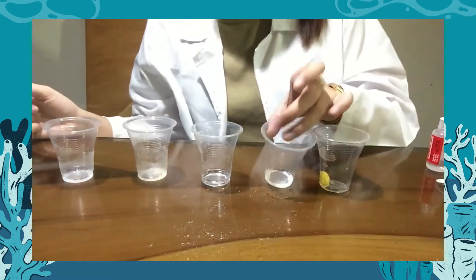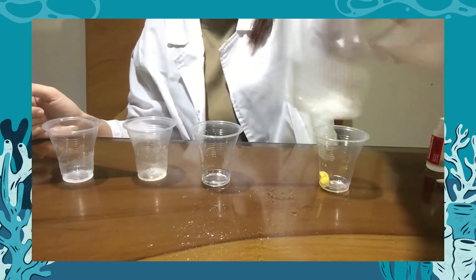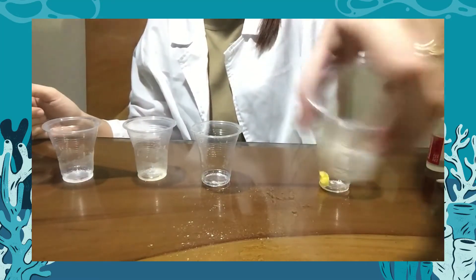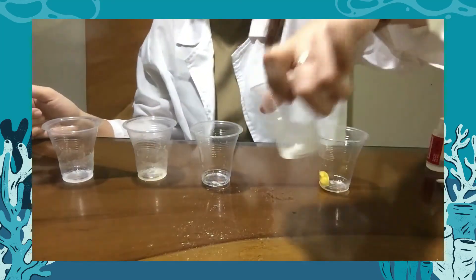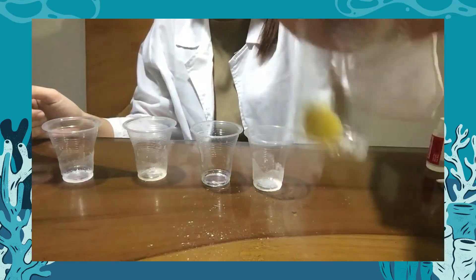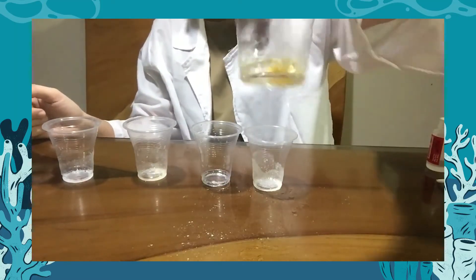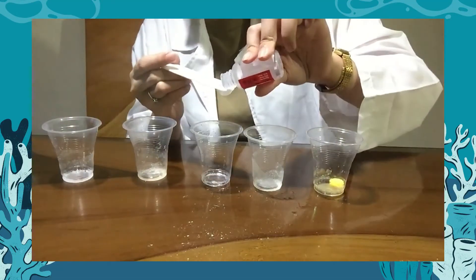With ethanol and acetone, it also formed a homogeneous mixture. The gelatin powder did not dissolve in acetone, and the margarine also remained intact and solid — the same result as with water.